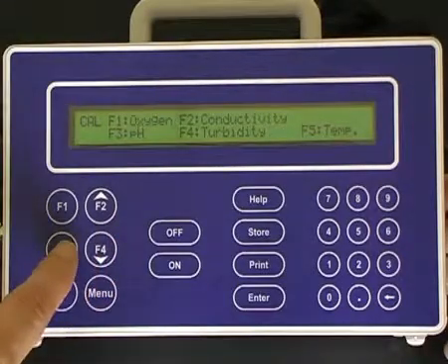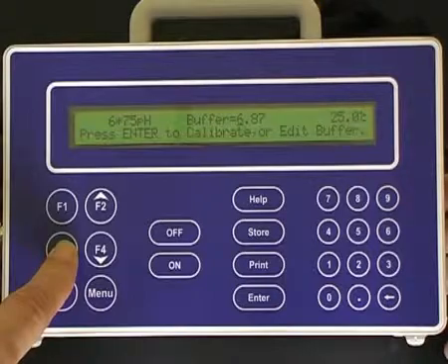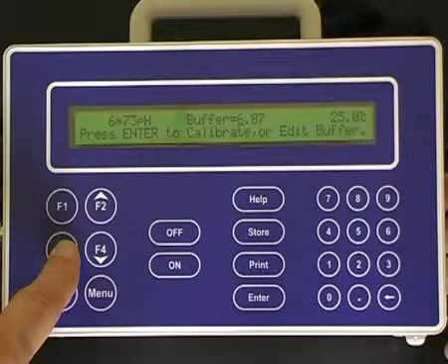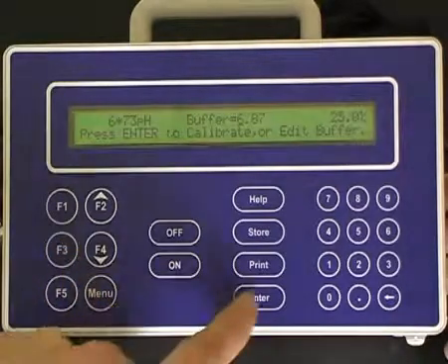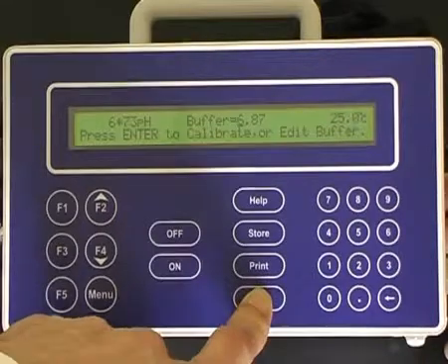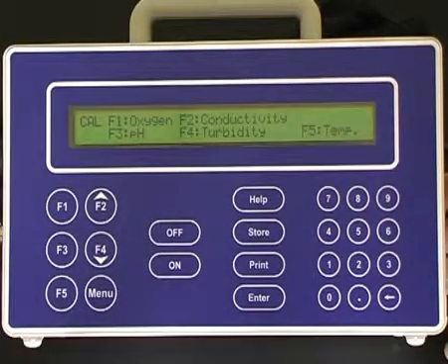Press the F3 pH selection. Allow the sensor to equilibrate to the buffer value. Once it has settled, press the Enter button again for the second point pH calibration. The instrument then displays the sensor performance: a slope and a symmetry.